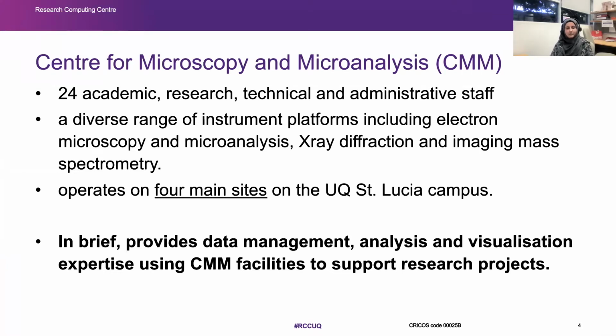All these instruments are operated on 4 different sites at UQ St. Lucia campus. So there's a big networking involved in all these different sites, which need to talk to each other within this network. And that was the main issue we dealt with before coming to this decision. So I'll be talking about that later. In brief, what we provide to our clients is data management, analysis and visualization expertise using CMM facilities.